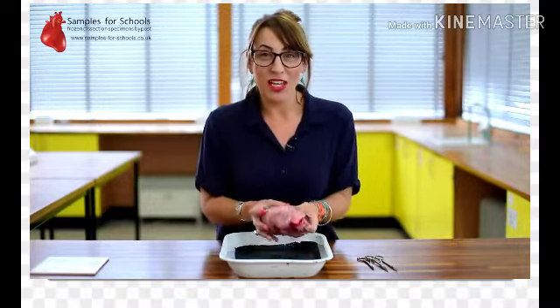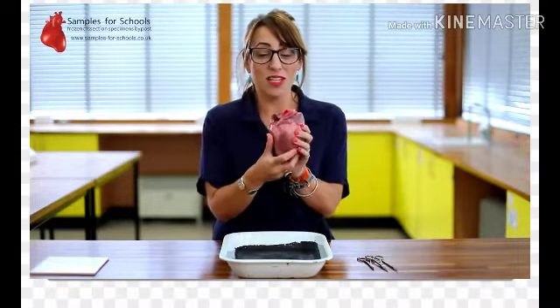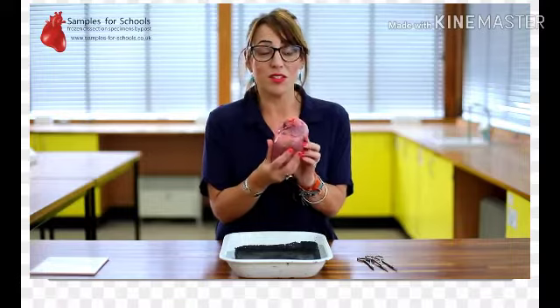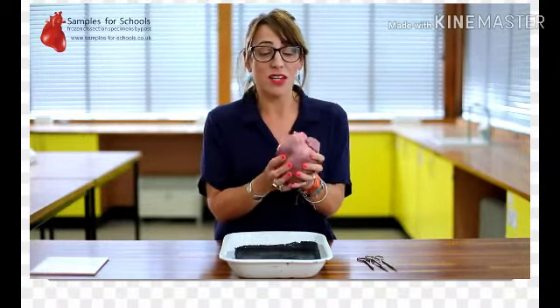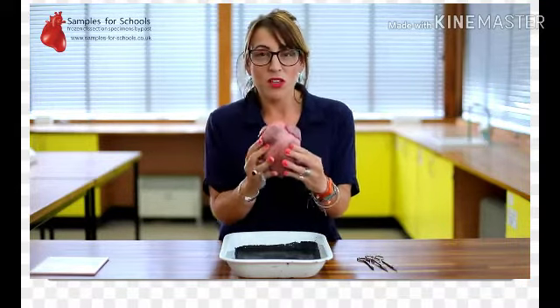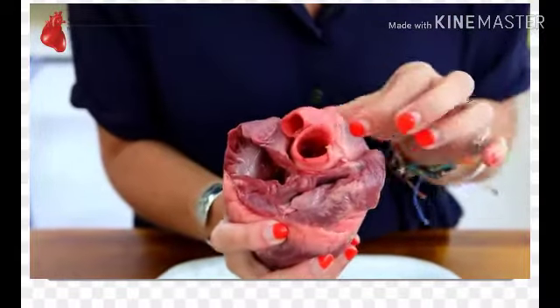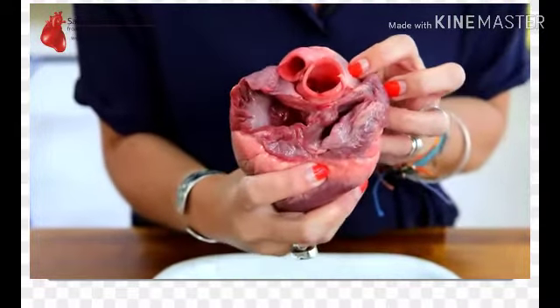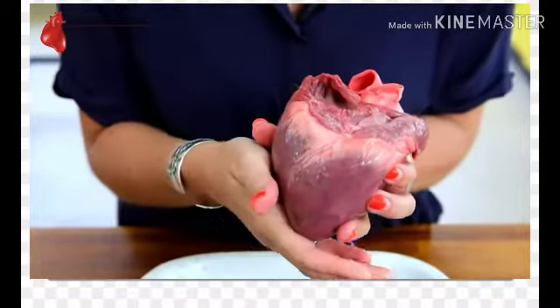So today we're going to be looking at a pig's heart, and we're going to be looking at all the components that make up how this muscly organ works to pump blood around the body. We're using a pig's heart because it's relatively similar in size to an average human heart, which is about the same as your fist. So if we look at this muscly organ, we can see that there are a number of blood vessels coming out of the surface.